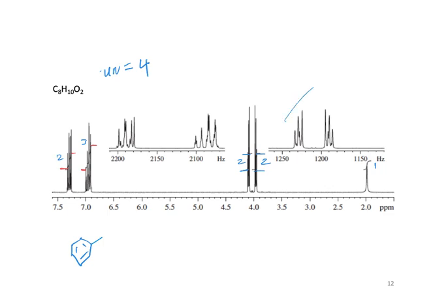Okay, look at these 2. This is a 2 and a 2. What do you think about those? I think that's an alkene. An alkene? A CH2 and a CH2? Yeah. That doesn't feel right. It just, 4 screams to me alkene.